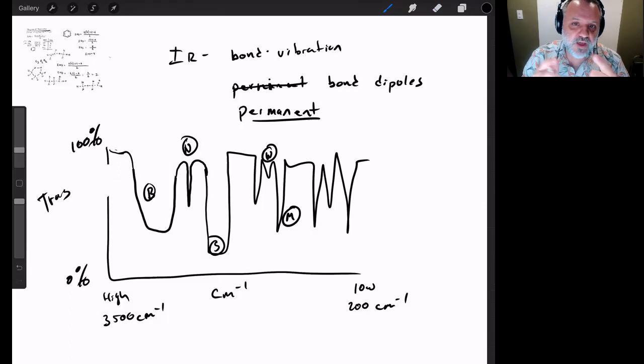So we've got to take a look at where the peak is. What is its relative strength, strong, medium, or weak? And then we also have to examine whether it's sharp or broad or narrow. Now, what I said before is that IR is not particularly useful unless you're really good at this. I mean, you've got a PhD in it, or you've got access to a database that has 1 million spectra already in it, and you take a spectrum and you just hit match, and it matches one. And then it tells you, hey, this is probably what it is.